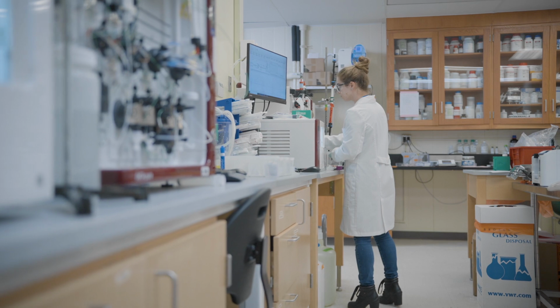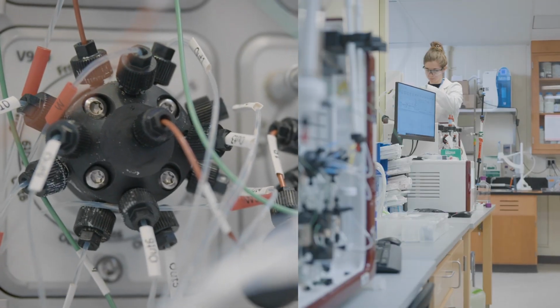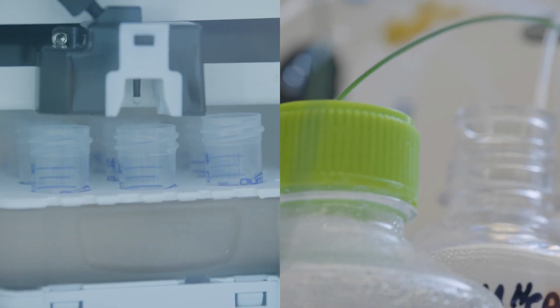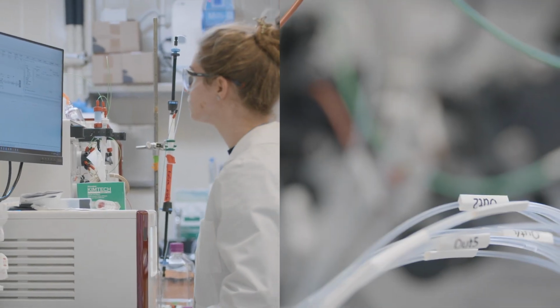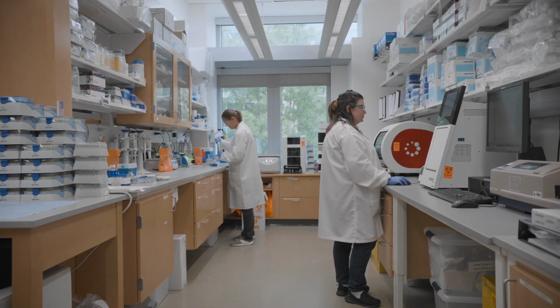We're working in next generation vaccines. Process development is an enabler to that manufacturing capability. Without that, you have a big void within your capability to manufacture that vaccine. Following the process development phase, there's a close collaboration with our analytics team to make sure that we're getting the product that we are intending to get throughout that process and that it's a pure product with sufficient yield.